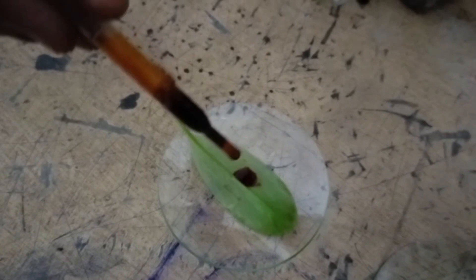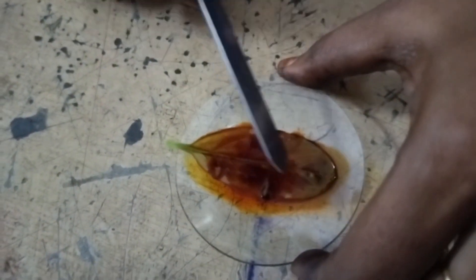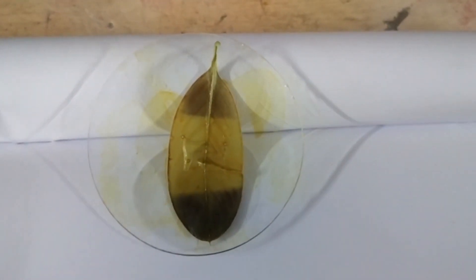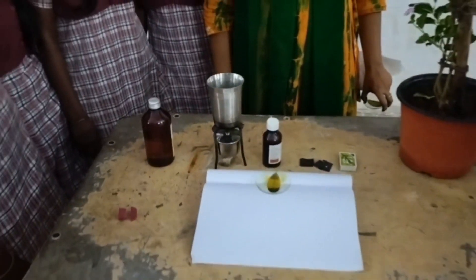Let us see which parts of the leaf turn to bluish black. We should spread the iodine evenly throughout the leaf. See the front and back part of the leaf turn to bluish black. The middle part does not change to bluish black because it was covered with black paper, so it did not get sunlight — therefore the middle part's colour did not change to bluish black, and food was not prepared there. If you look at the middle part, you can see a diamond-shaped blue colour — that is where we also cut the black paper.